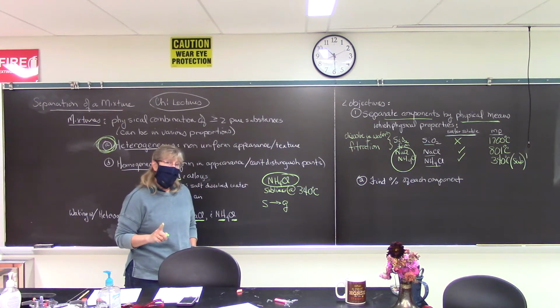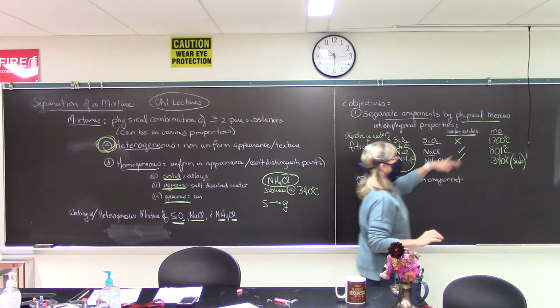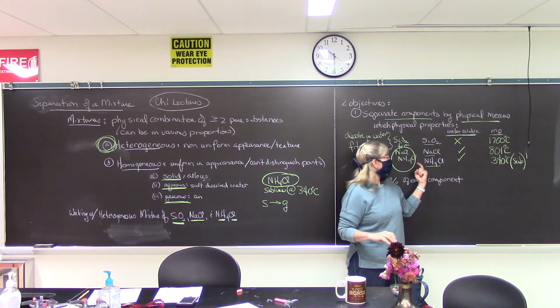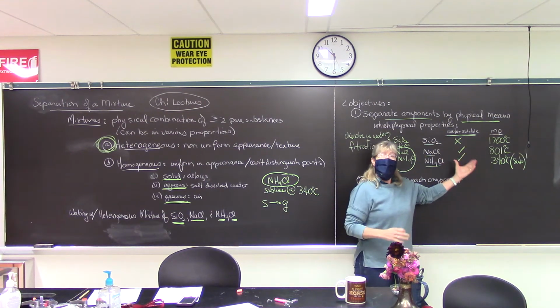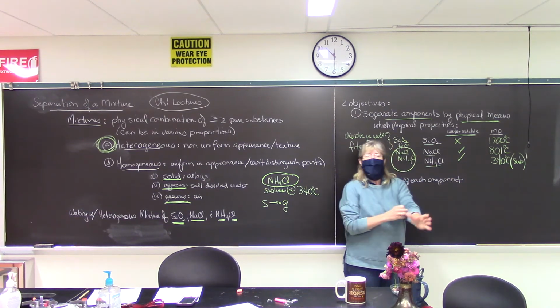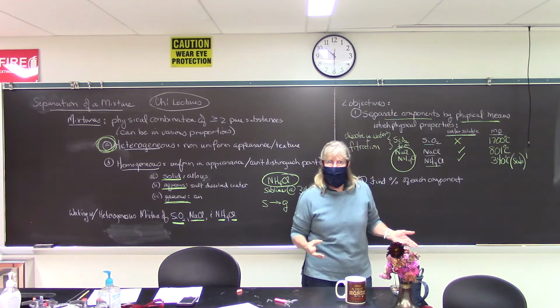This is cool. You can heat a mixture of sand, salt and ammonium chloride with a Bunsen burner and watch the ammonium chloride sublime. It's awesome. People tend to say it's smoke. "It's smoking, Mrs. French." No, it's not.